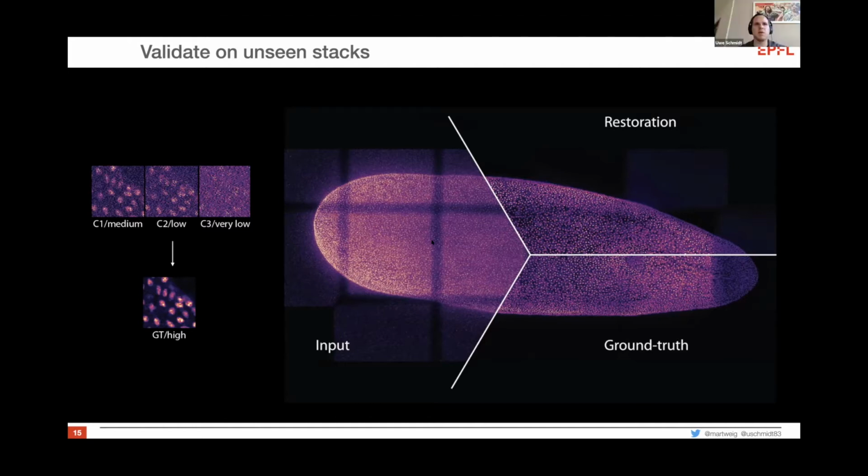Yeah, and for the earlier question, this image restoration is useful if you can then use a traditional segmentation pipeline, for example, a non-learned pipeline, or if you just, of course, have the images to look at by a human, it's much easier, right? So it depends. If you want to do segmentation ultimately and you can annotate your data or have segmentation labels, you can do it directly. But sometimes you can also use this image restoration to even be able to annotate. Sometimes you cannot even see the nuclei clearly in the low SNR. So you could use the restoration approach to help you annotate and then use that in the second step to directly train a segmentation network on the low SNR data.